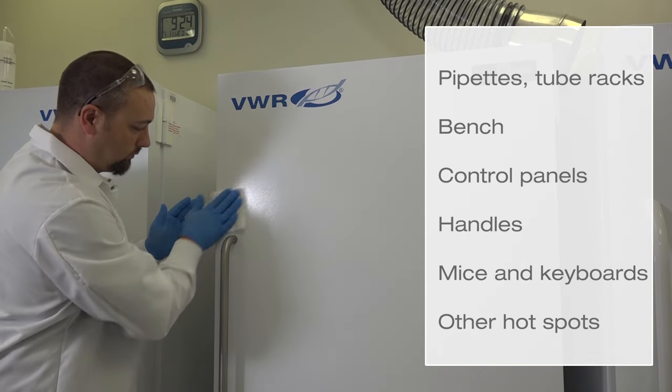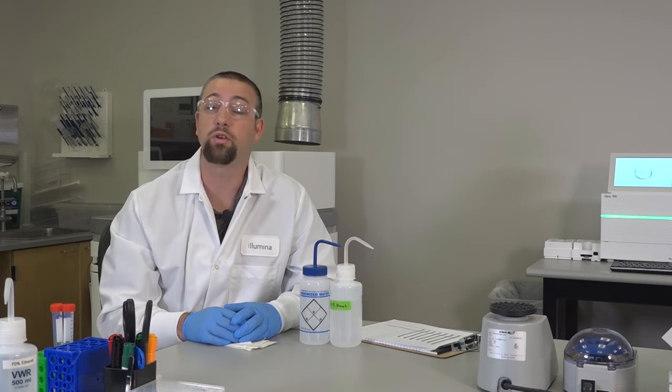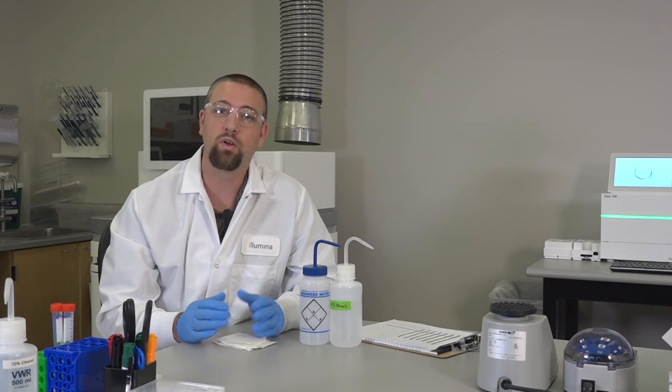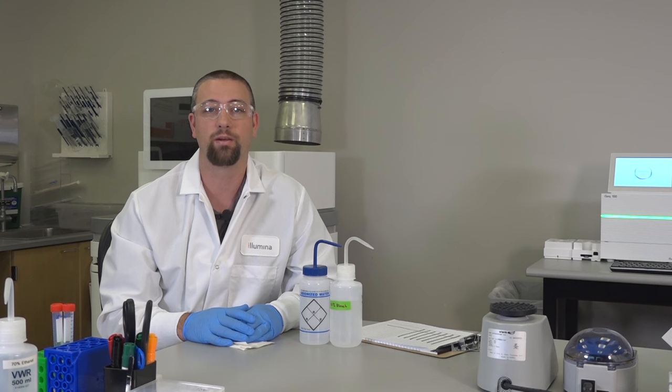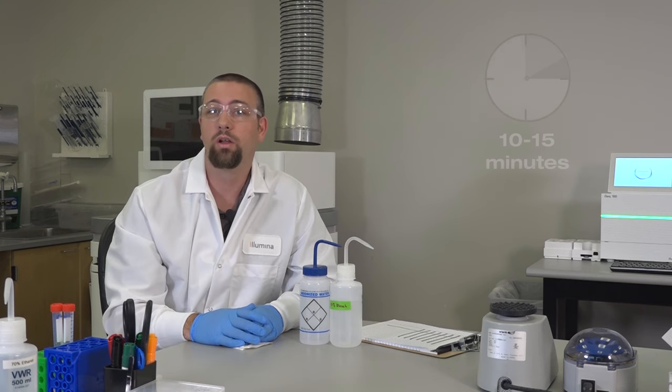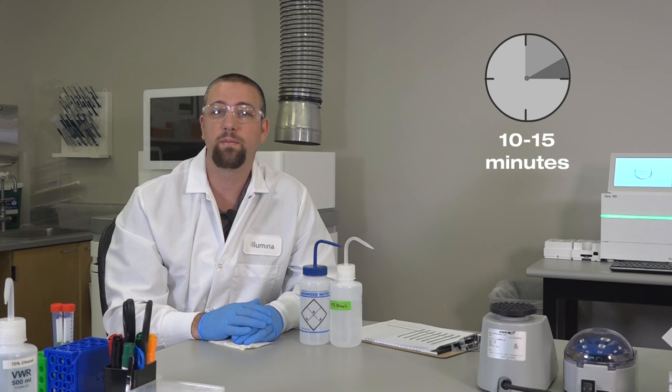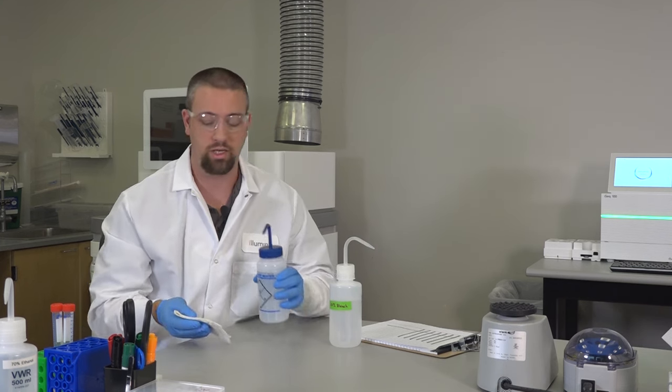Solutions with low concentrations of bleach can lose potency quickly and variably based on your specific lab environment. For best results, make fresh bleach solution daily from a higher concentrated stock. Also, if the surface is bleach resistant, wipe it down and then allow 10 to 15 minutes before using a paper towel dampened with water or 70% ethanol to remove the residual bleach.